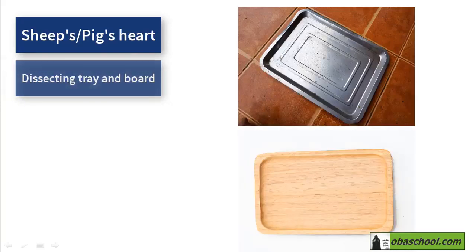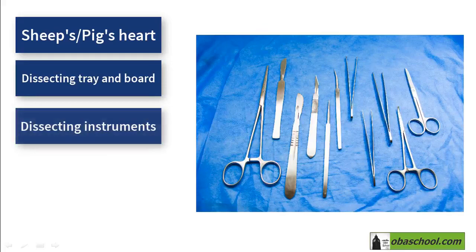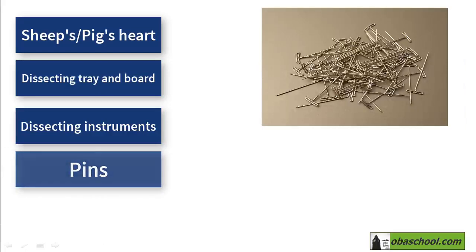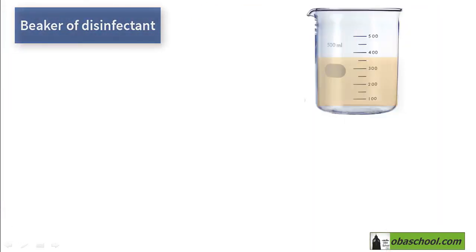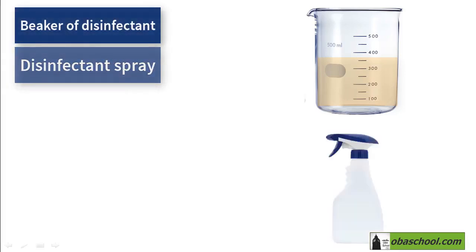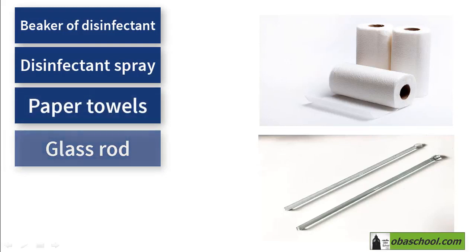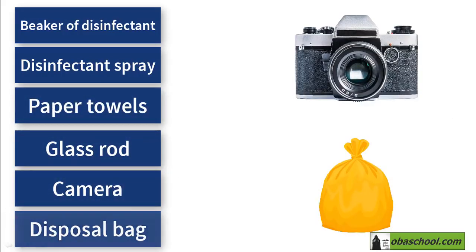We also need a dissecting tray and board, dissecting instruments. The most essential ones are a scalpel, scissors, and mounting needles, pins, plastic gloves, beaker of disinfectant, disinfectant spray, paper towels, glass rod, camera, and finally a disposal bag.